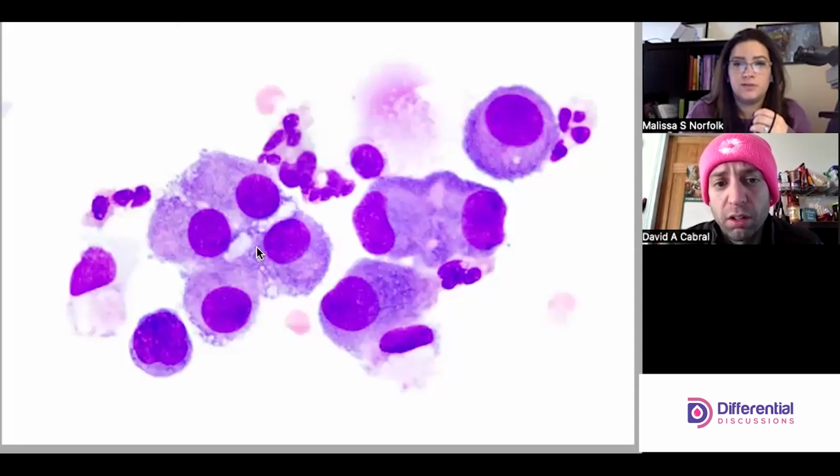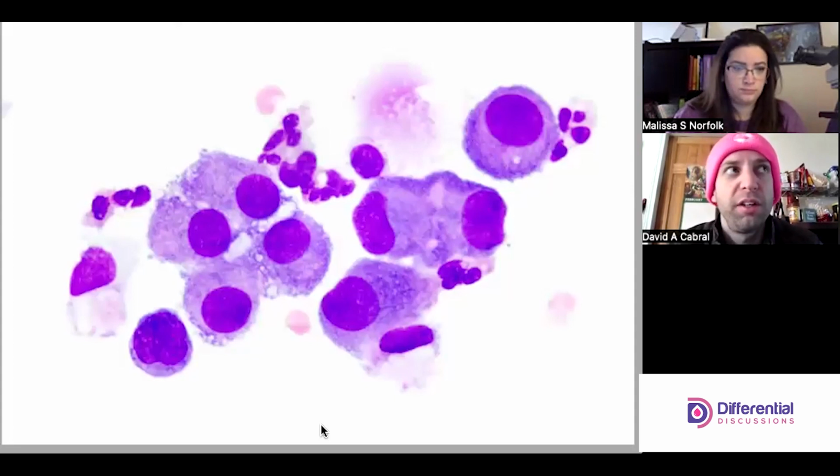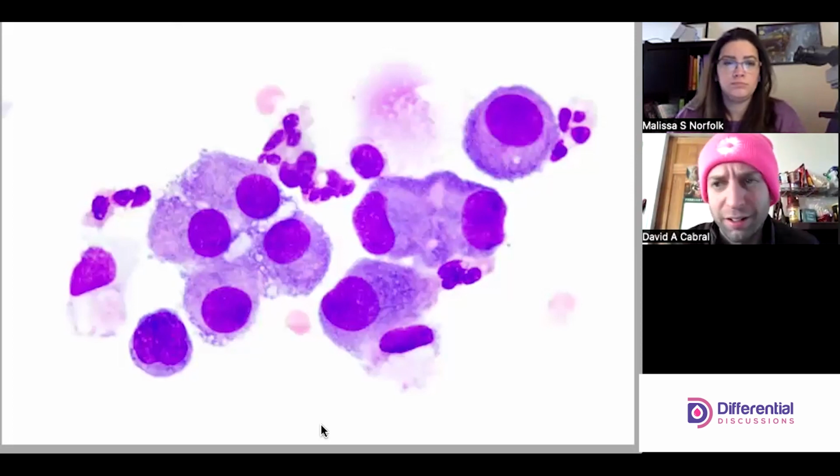That one also looks like it's partnered with these three here. Like this is the window for those two. And plasma cells don't partner. They don't have windows. They're not attached to each other. Exactly. A plasma cell will never be close and adjacent to another one. Are there malignancies where it's possible that you're catching a mitotic transition, where there's cell replication? I suppose so, but there's just so many things.